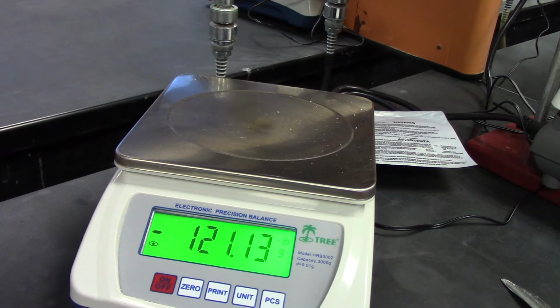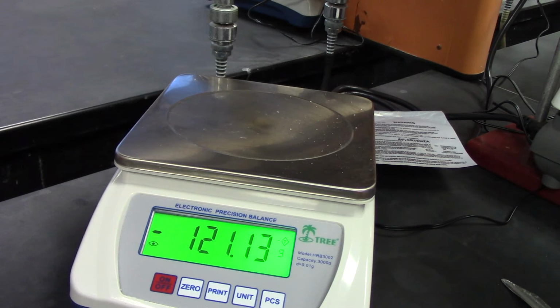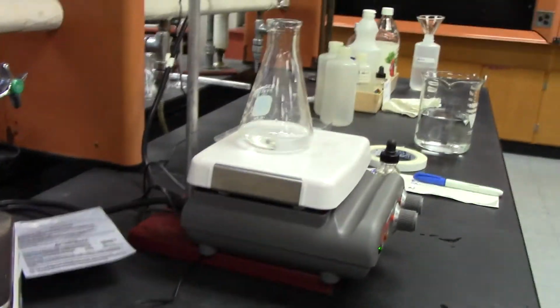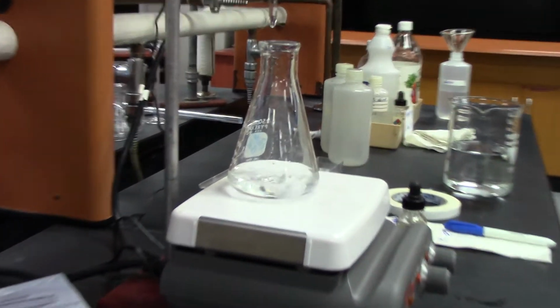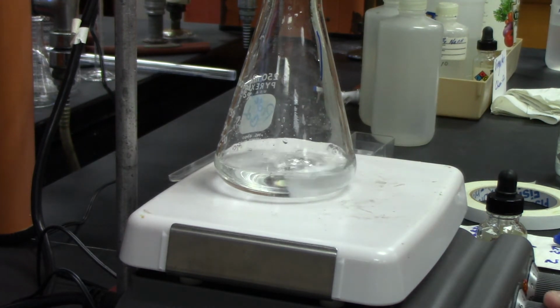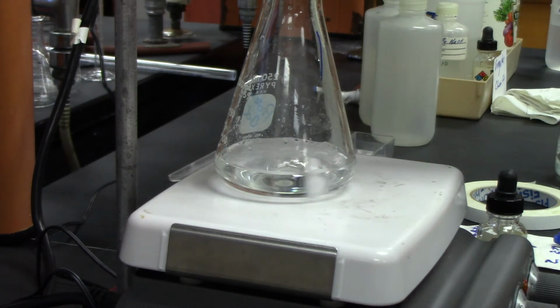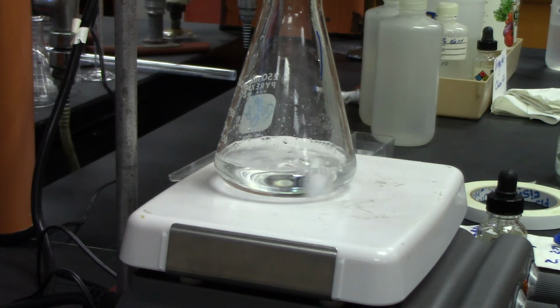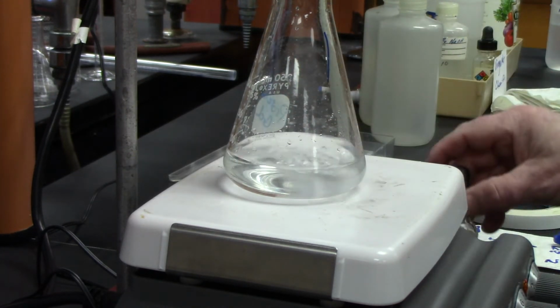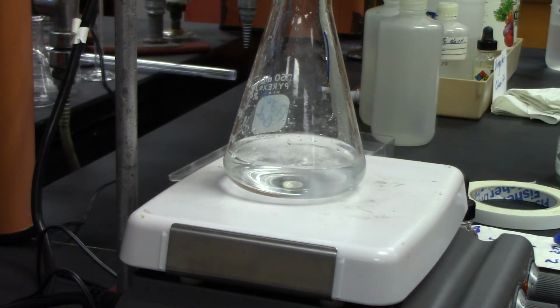Now I add the phenolphthalein to my acetic acid, 3 drops. Then I'm going to start adding the sodium hydroxide again until it turns pink. Now I don't know how much I'm going to have to add. So far, there's not a lot of pink here, and I'm at 15. As far as adding the phenolphthalein, it doesn't really matter how much you add. You can add 2, 3, 4, 5 drops.